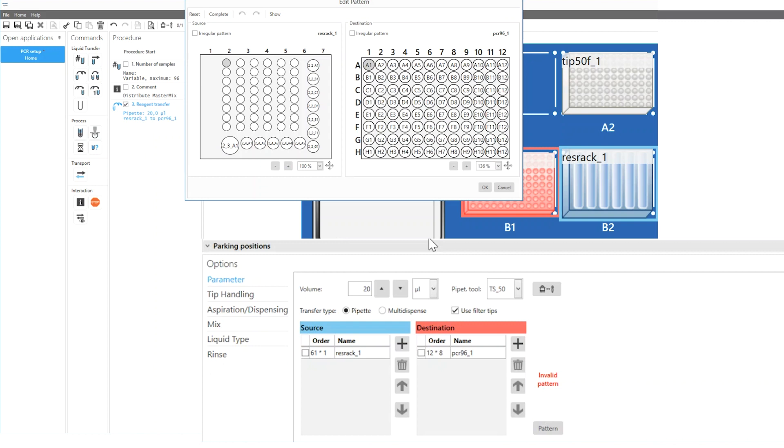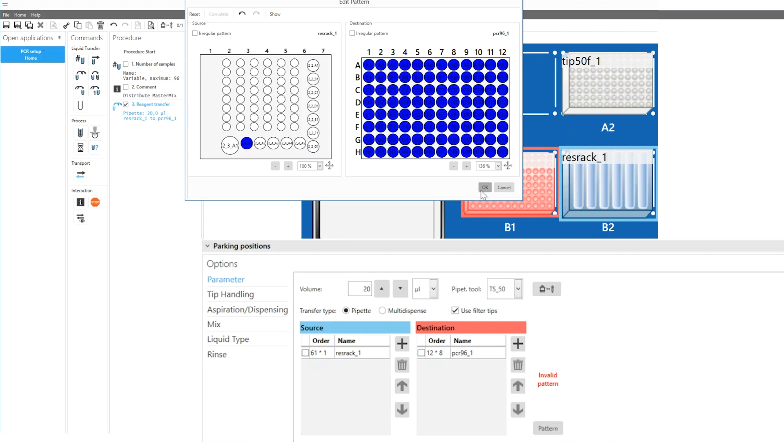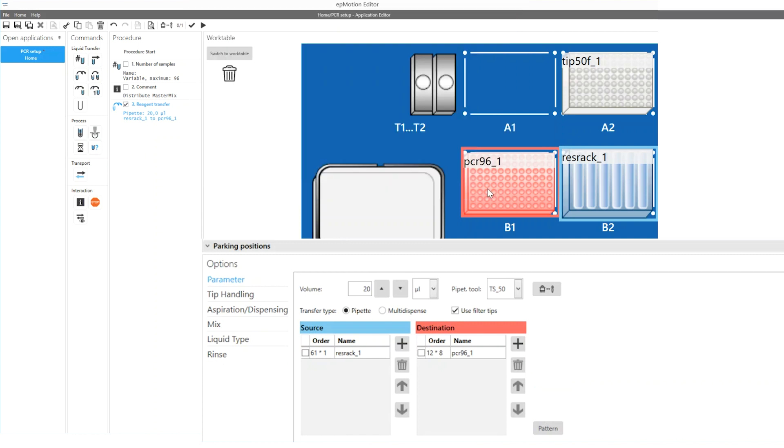Finally, you need to define the pipetting pattern. But don't worry, this can be done with just two clicks. Simply define the vessel that contains your PCR master mix and press complete. The pattern of the destination labware is automatically added by the software.